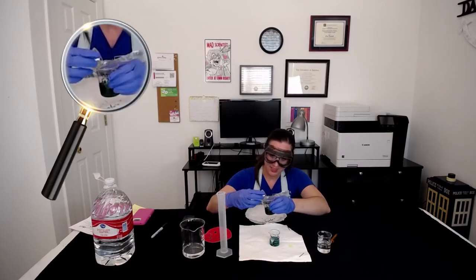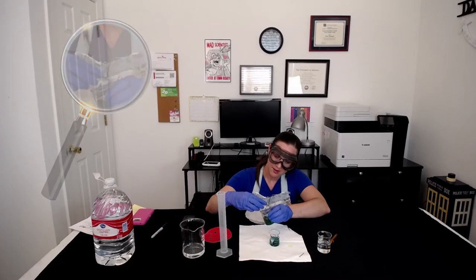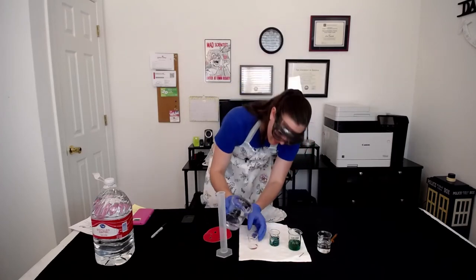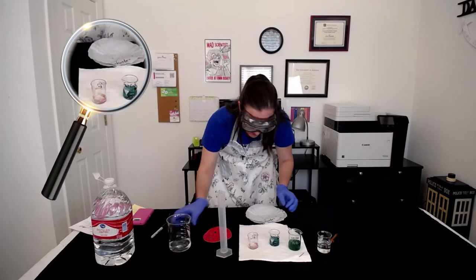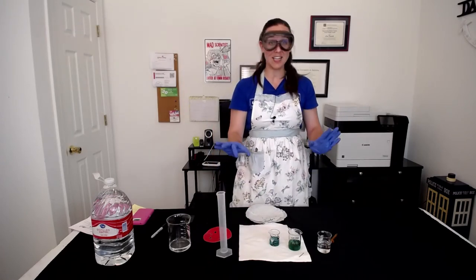Now let's decant off the HCl into the same waste beaker we've been decanting into this whole time. And then lastly, we'll wash it one more time with about 10 or 15 milliliters of deionized water. Give it a nice little swirl, and we'll have clean copper to work with.